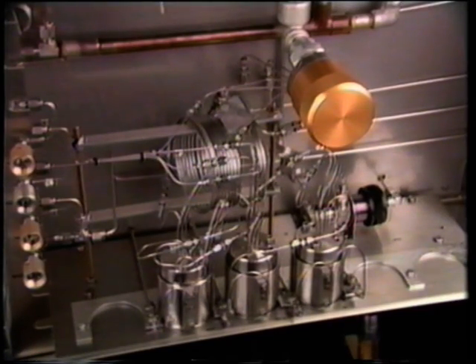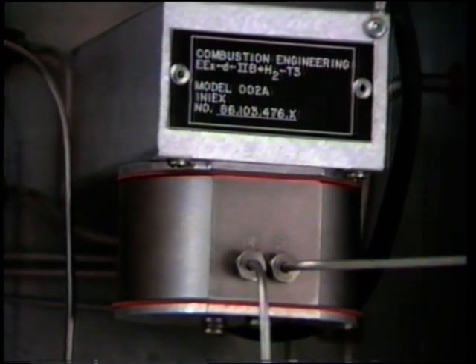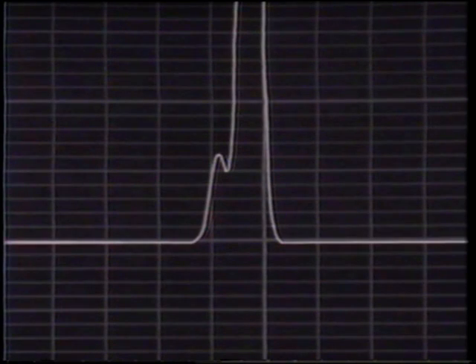Sample size can affect separation and sensitivity of the detector. Sensitivity is the ability of the detector to measure the concentration of a component with respect to the sample size. For example, detectors may not be able to measure low concentrations of components in small sample sizes. Sample sizes that are too large may reduce separation, which may cause peak interference.